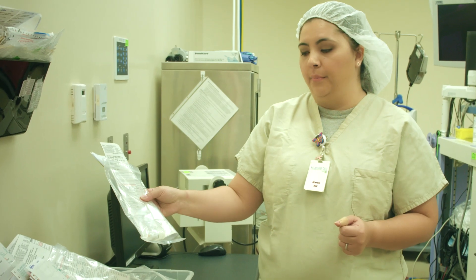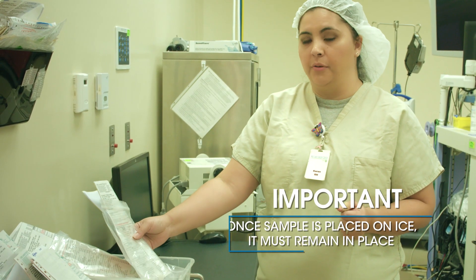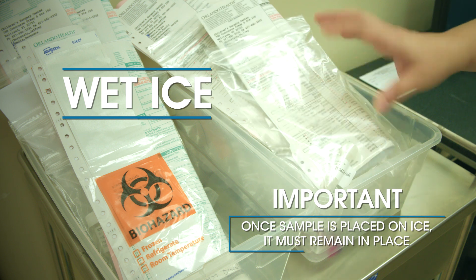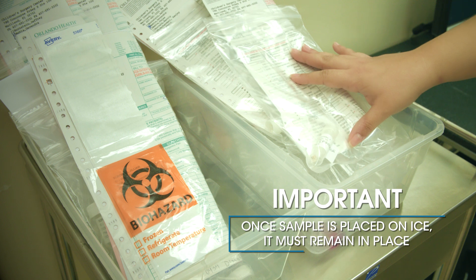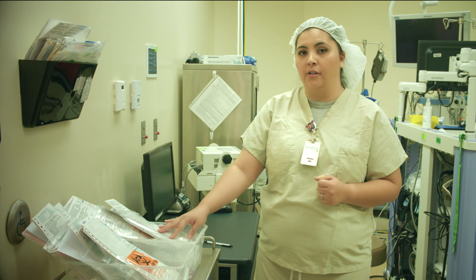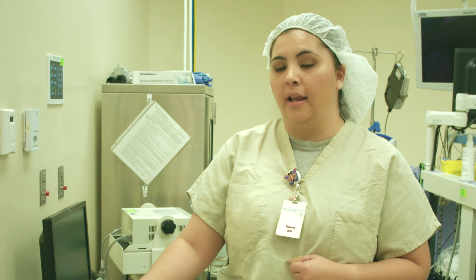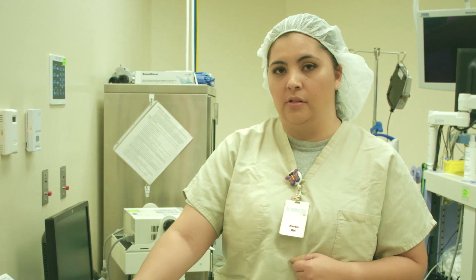This is a disaccharide sample. This sample gets placed on ice shortly after being retrieved from the patient. We here in our facility have only wet ice available to us, so we do place it on wet ice. You are able to place these on dry ice as well or a freezer. Once this specimen is placed on ice, it must remain frozen for the entire time during transportation and arrival to the lab. We keep it on wet ice until we get a courier that has dry ice available, and from there they are transported frozen.